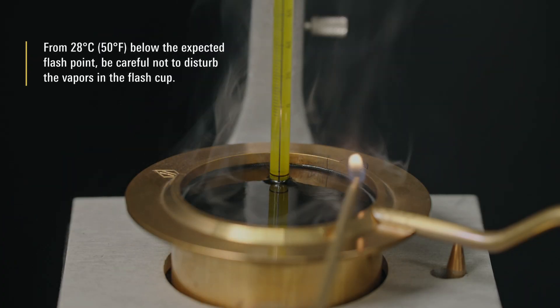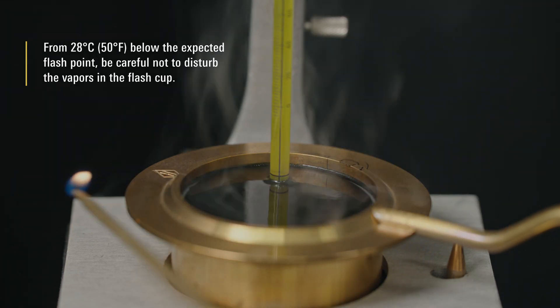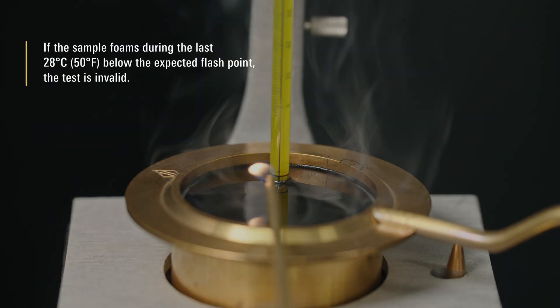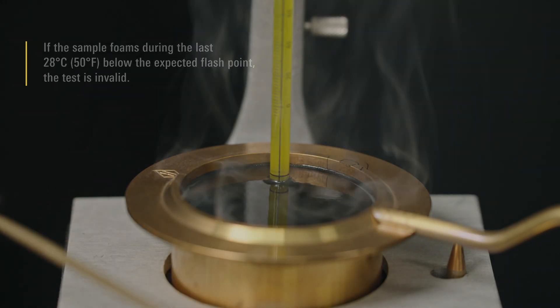From 28 ºC below the expected flash point, be careful not to disturb the vapors in the flash cup. If the sample foams during the last 28 ºC below the expected flash point, the test is invalid.